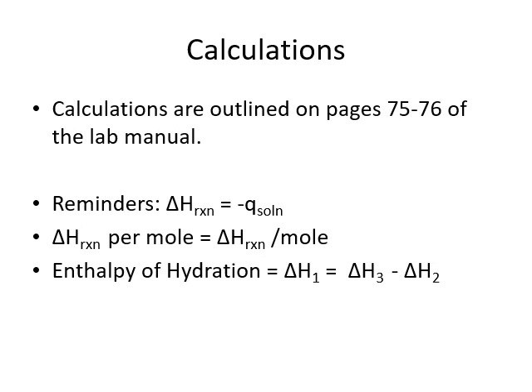If you want to find the enthalpy per mole, which is helpful because it helps to standardize the measurements that you're making, all you have to do is take the enthalpy that you calculated and divide by the number of moles of the compound. So either the magnesium sulfate or the magnesium sulfate heptahydrate.